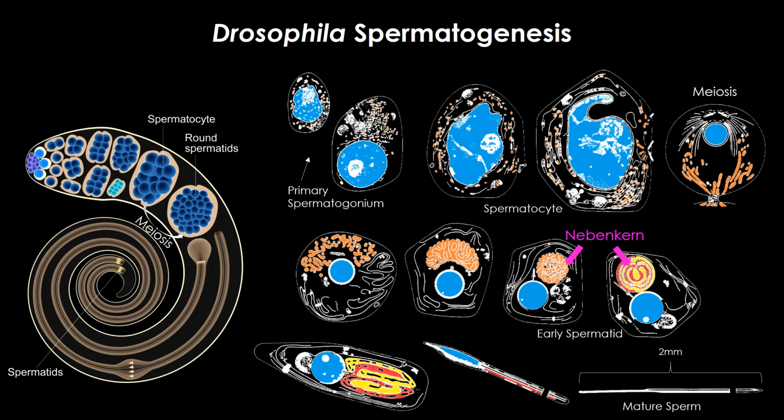So in order to get better insight into this process, I applied several microscopy techniques. I used EM, but EM is really hard to perform, and you need to fall exactly in the correct slice, and you get only a thin section that doesn't represent the whole tissue. So I turned to expansion microscopy. Expansion microscopy is a really nice technique that allows you to use a regular confocal or any other fluorescent microscope to visualize your samples, and it gives you much better resolution.